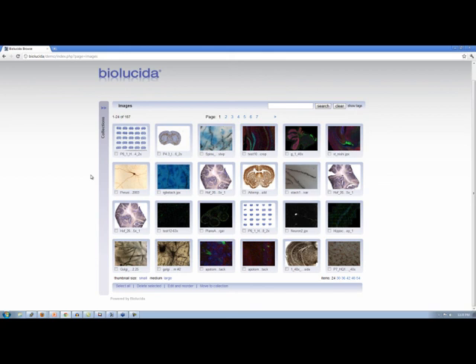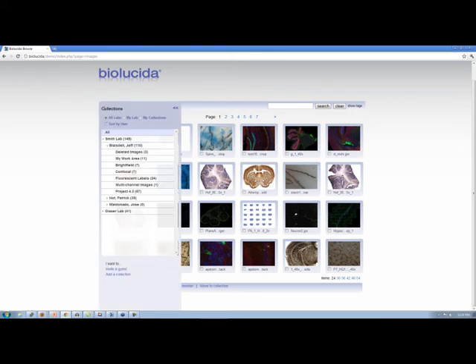Now, to see the list of collections, we click on the double arrow, which is shown in the upper left. And you probably noticed me doing this in the viewer earlier. So I'm going to click on that double arrow, and that's going to open up a window which lists our collections. So as you can see here at the top, we have the Smith Lab. I'm a member of that, and below me you see a number of collections. So all of this list below here are collections that I've previously created.